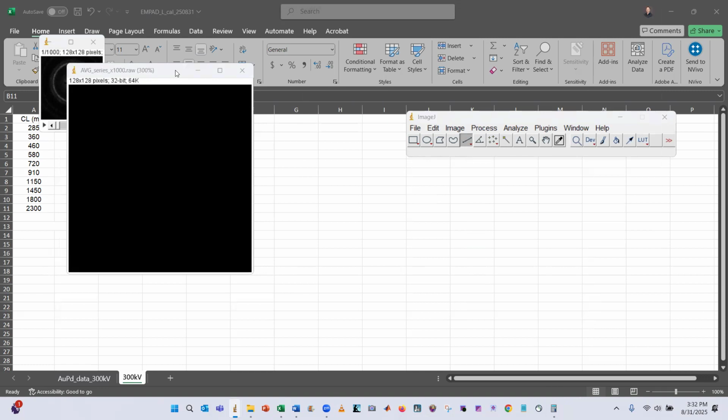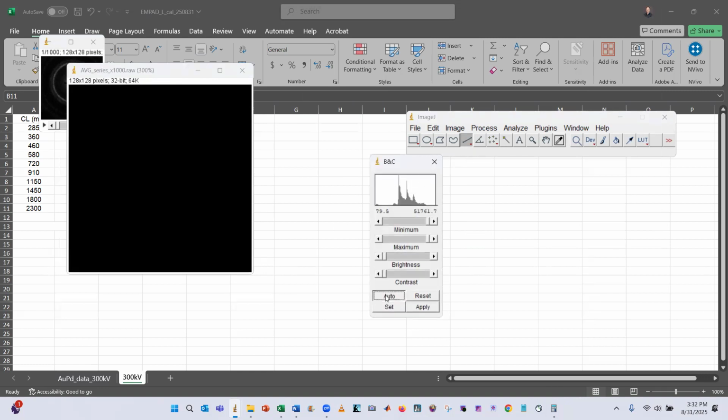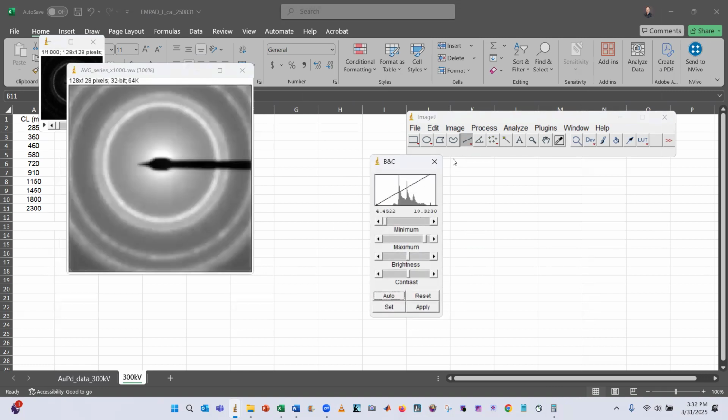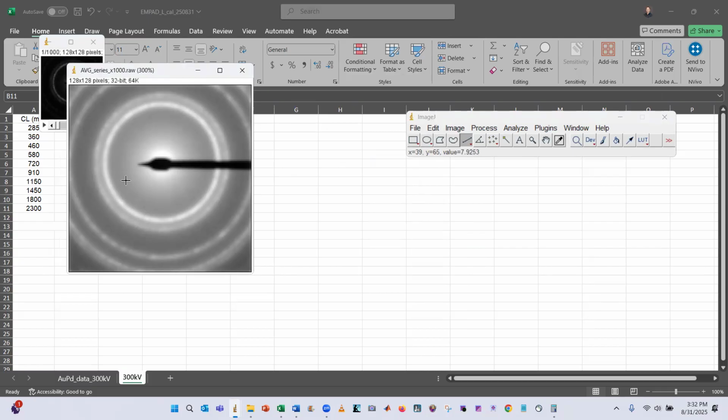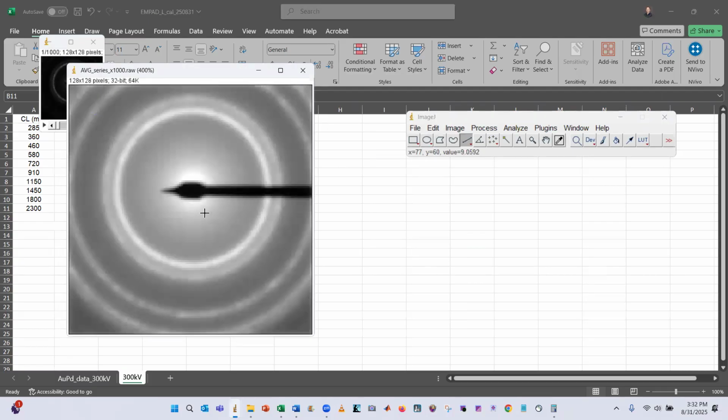It's a shame it doesn't do an auto adjustment to this. You have to do it manually, but yeah, the result is certainly worth it. Okay. All right. So we can't quite see the third ring, so let's keep going with the second one here.